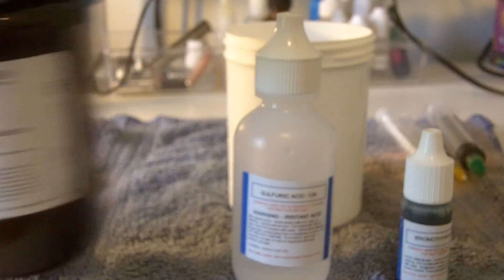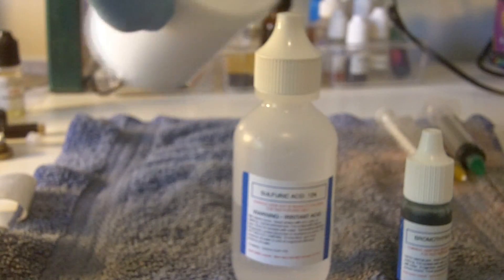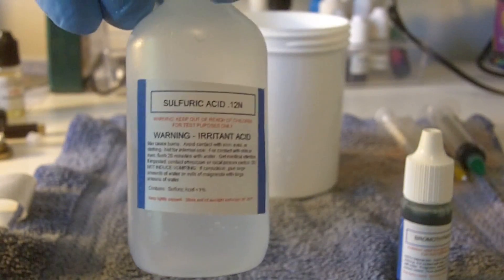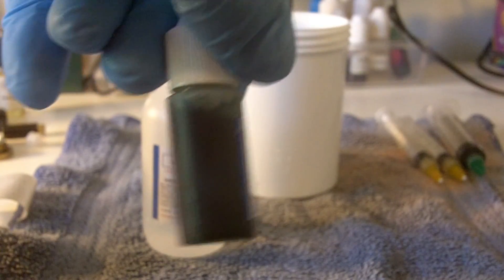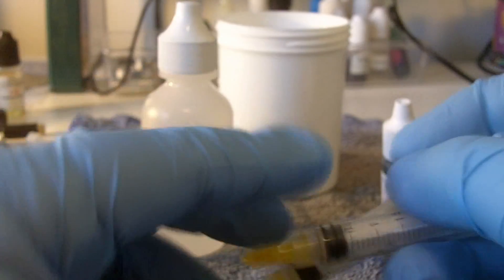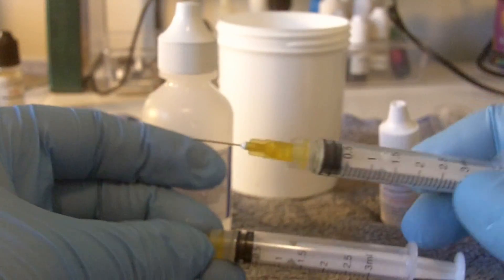That is the DIY nicotine test kit. What you get with the kit is a little white plastic cup — it looks like it should have a screw cap top but it doesn't — a bottle of sulfuric acid which is diluted down to a reasonably safe level, and a bottle of bromothymol blue, which is a chemical dyeing agent we're going to use in this test. You also get a pair of very small, fine-needled syringes — they are three milliliters, and they come new in a sterile package.